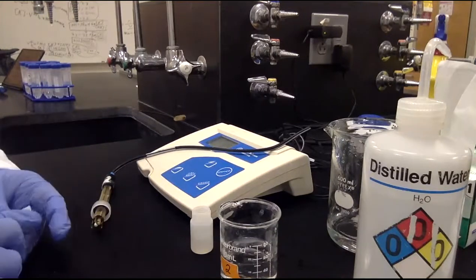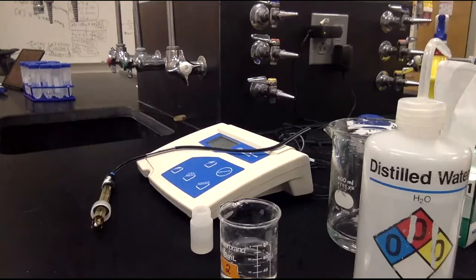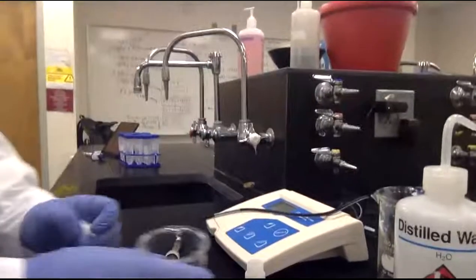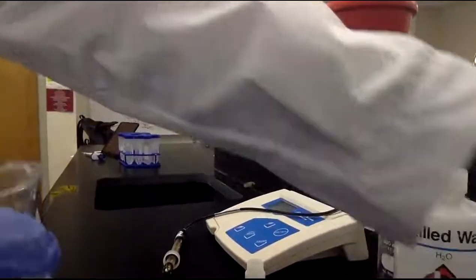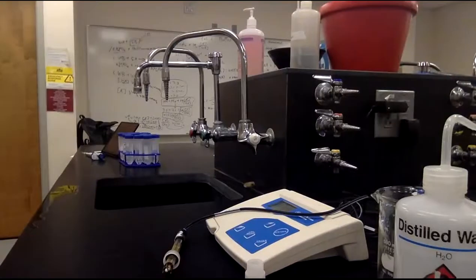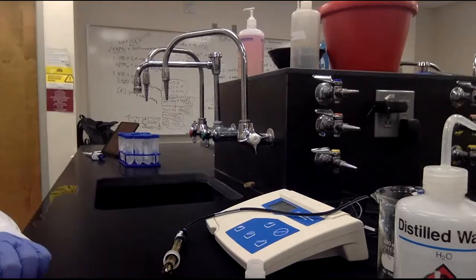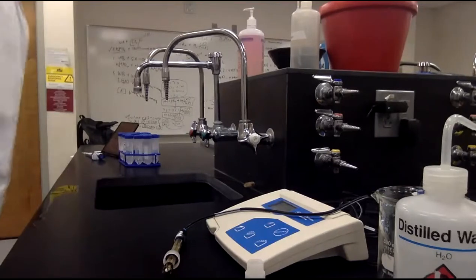So, right, okay. This guy's the weak acid plus weak base combination. I'll be using these 2 guys since that guy had a bit of a split, which might confound the data. So 1 and 3. And so you want me to put 500 microliters of the acid and the base in one and the other, right?